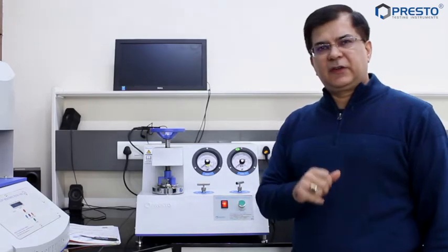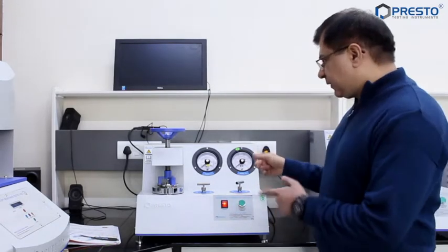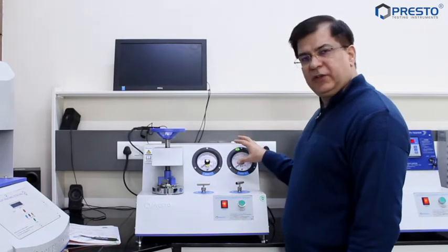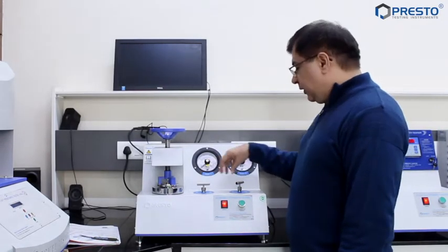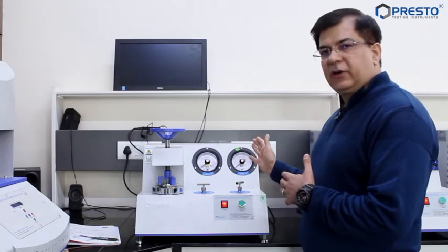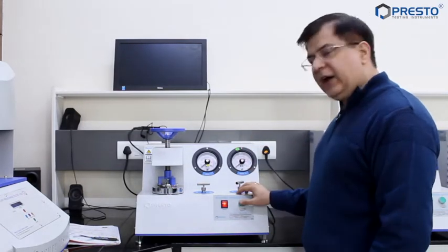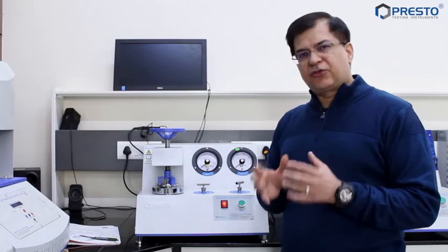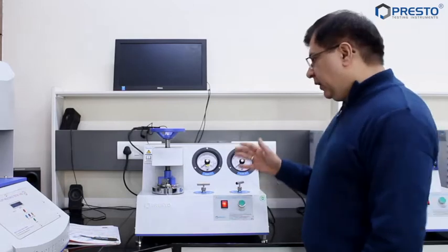We are going to showcase and demonstrate some of the finer nuances and aspects of using a bursting strength tester in your laboratory. This is a Presto bursting strength tester. It has two gauges and two valves. These valves are used to choose a particular gauge. With a simple push button, this is by far one of the most simple instruments to check your bursting strength and bursting factor of your corrugated boxes.